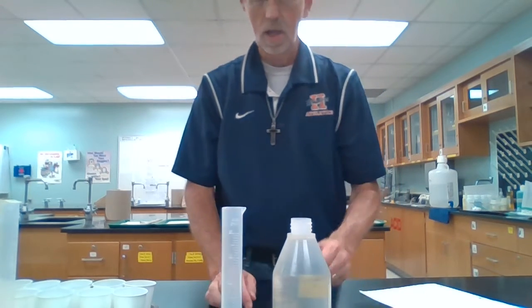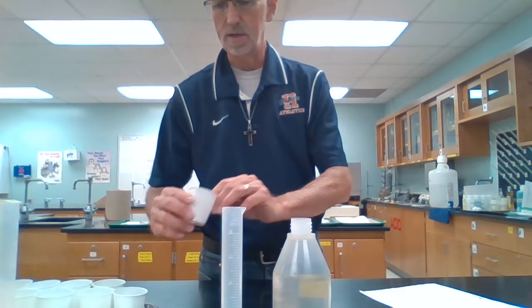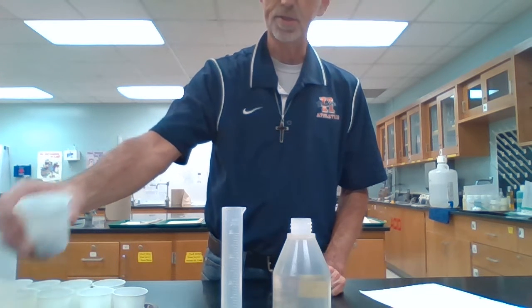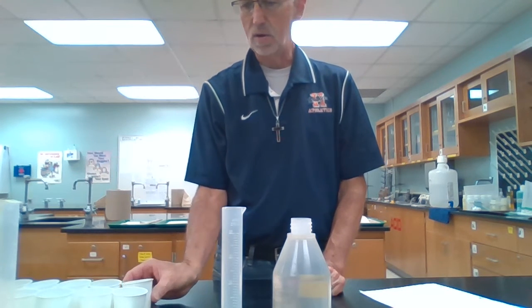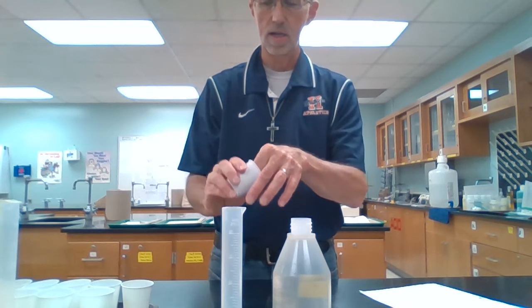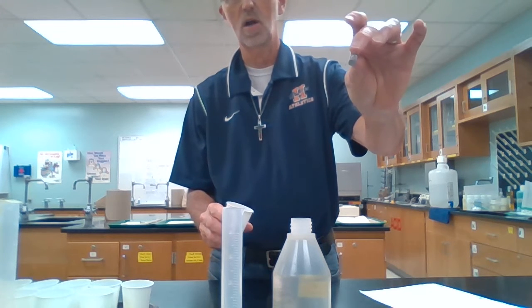So what I'm going to do is the masses first, and then we'll do the volumes second. The reason is that you can see some of our samples are small pieces, or like this one, irregularly shaped larger pieces.